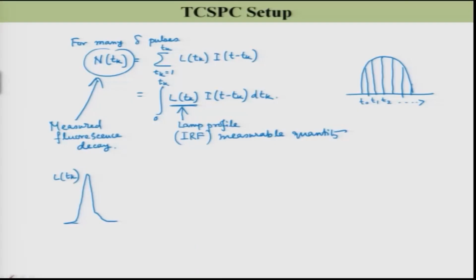So, for this 4.2 nanosecond, simply this will follow e to the power minus t by 4.2 nanosecond. So, the intensity will decay accordingly. So, ideal case, you will get such kind of curve. So, this is your true I(t) which has the form e to the power minus t by tau.